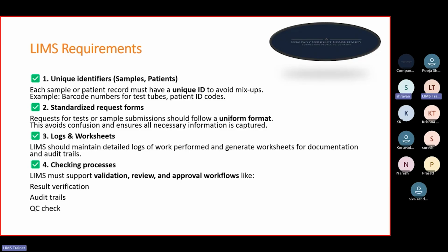As per their requirement, you need to get it developed by the developer. If it is standard, then it is okay, and if not, you have to get it developed. After that, to test it, you will require the master data, so as a LIMS consultant, you will create the master data.